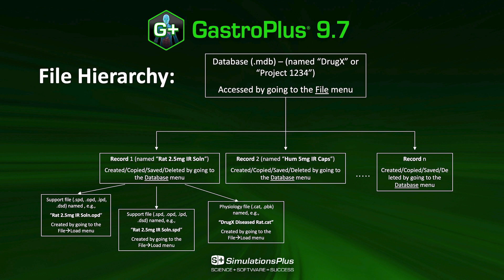GastroPlus is composed of multiple files organized as such. First, you have the database at the top that contains all of your project information, and it can be accessed on the file menu of the software. Within this database, you can create multiple records that will represent a specific study. For example, in that case, you have record number 1 for a rat study that received 2.5 milligrams of an immediate release solution of a specific API.